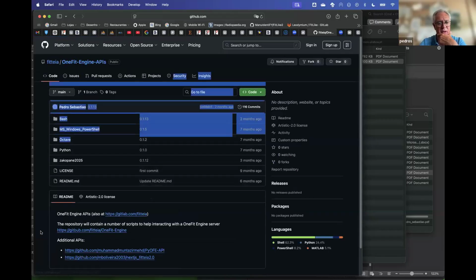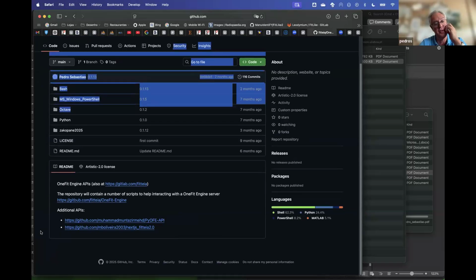Probably the one that is more interesting for new users that might have a go, especially if you are dealing with the Stelar output results and you don't have the most recent NMR console, which might also already include the fitting engine, is this Muhammad API in Python, which helps you analyze the SDF or HDF5 files that are saved after a fast field cycling experiment, and you can post-process the magnetization decays using this interface and the fitting engine.